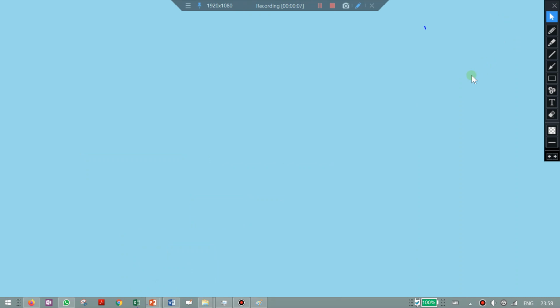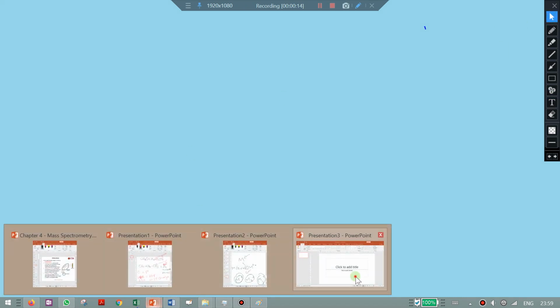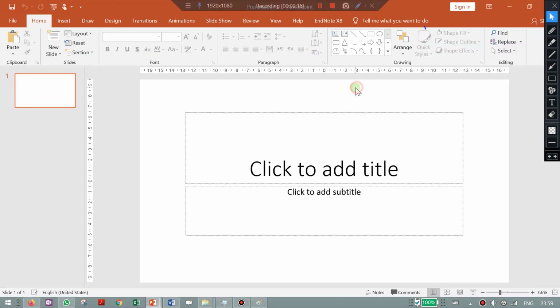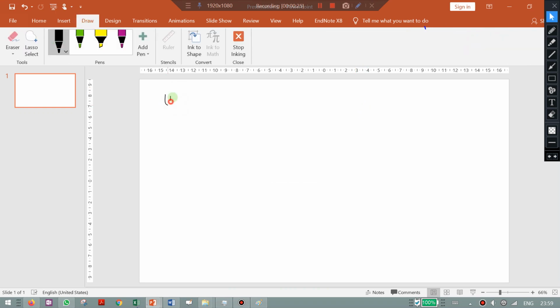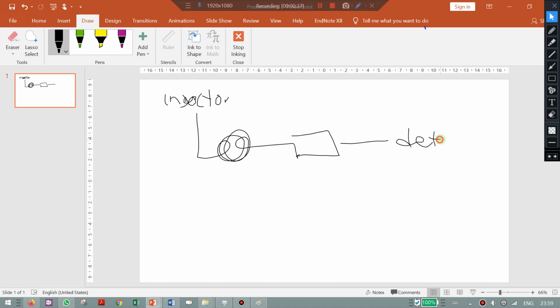Again, before I forget, can we go back to basics. Remember, if we look back, for example GCMS, we have the injector. We inject into the column, then we reach the mass analyzer and our detector.